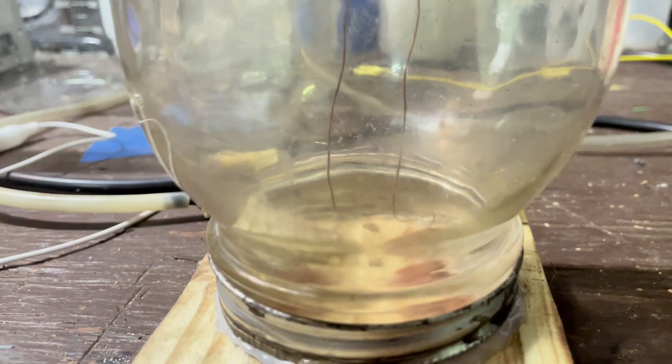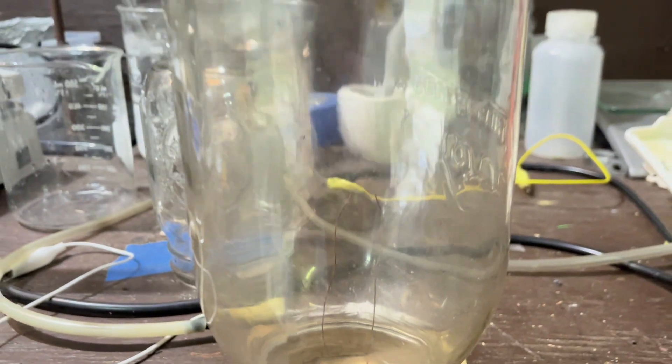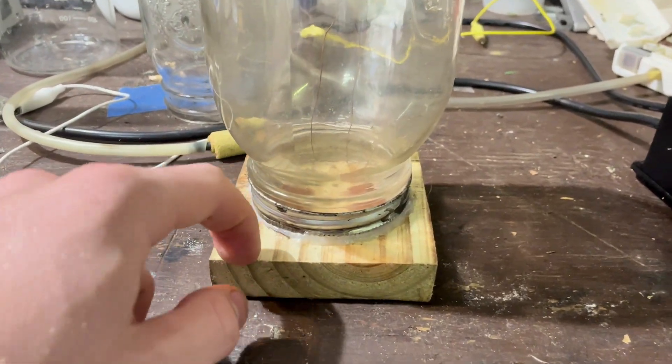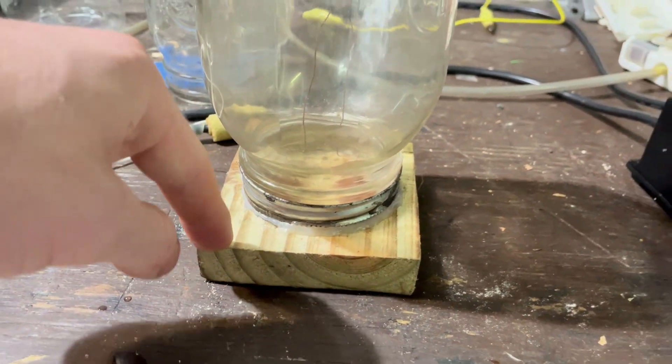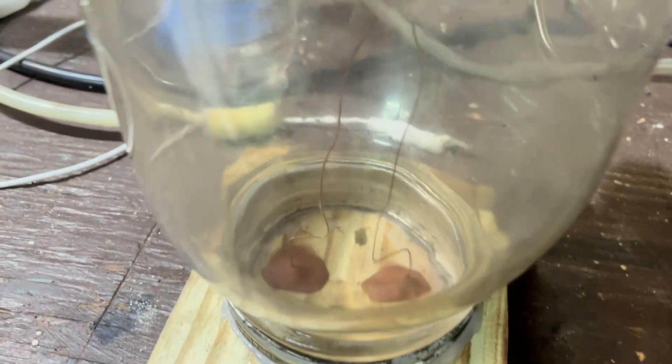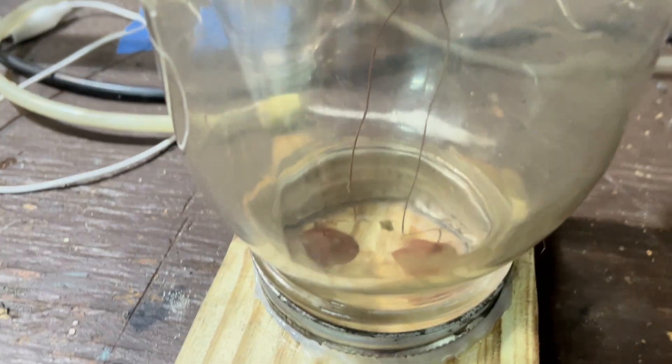What this is right now is I have two wires in this sealed jar that I have screwed down into a piece of wood. This is very jank. Please do not try and build something like this — I burned down the last two that I made, so I put some clay in there to hopefully help it not do that.